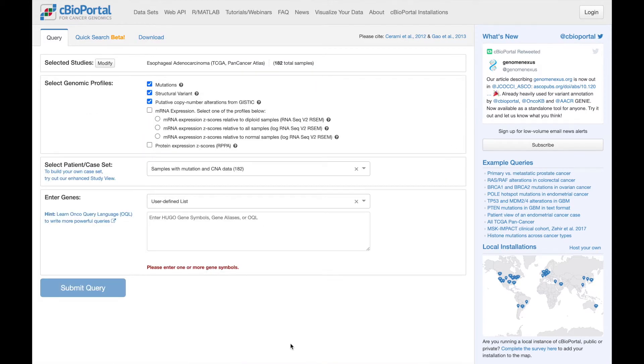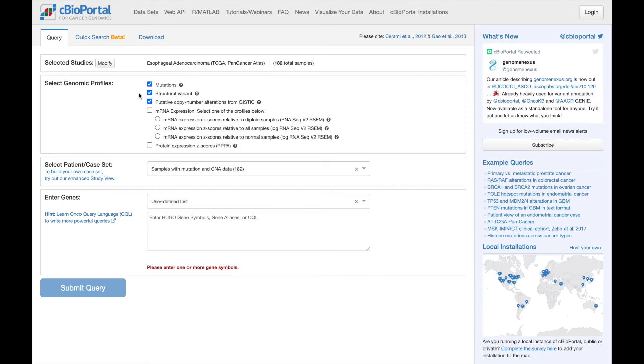Having selected a study, we can now define the parameters of our query. First, select the molecular profiles to query against. By default, mutations, structural variants, and copy number alterations are selected if those profiles exist for the selected study. You can also choose to include mRNA or protein expression, although I'm not going to do that here.